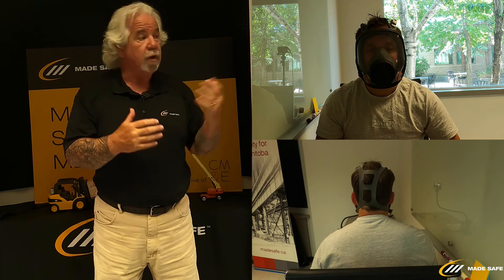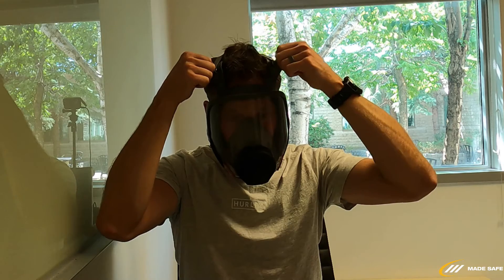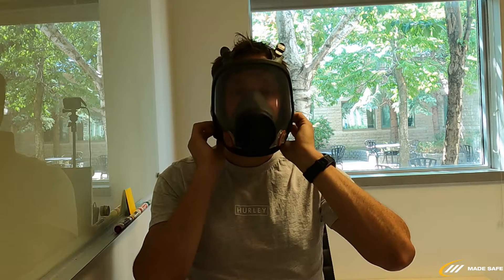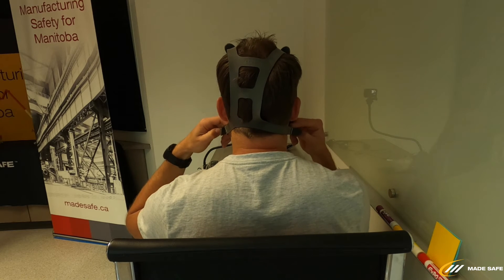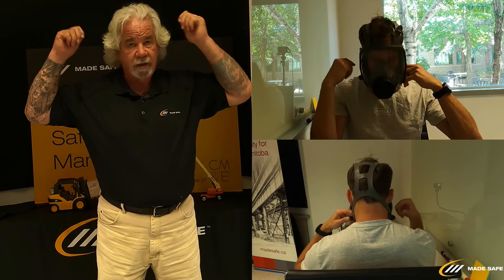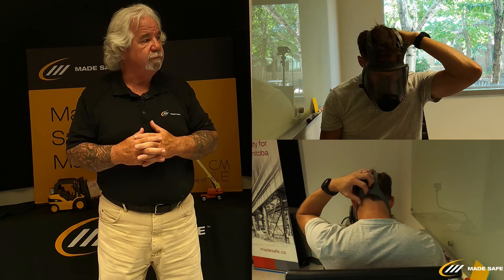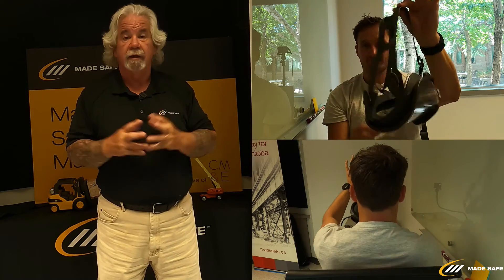To doff the full face mask, loosen the straps on the forehead and the four connections where the harness attaches to the mask. Once that's done, Reg reaches back with either hand or both hands and removes the mask without touching the mask itself. That's the complete process for all three masks — the donning and doffing and the negative and positive checks.